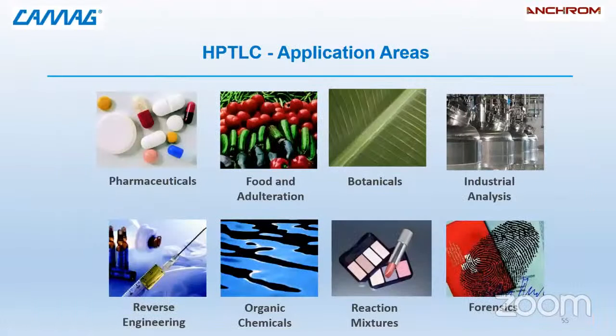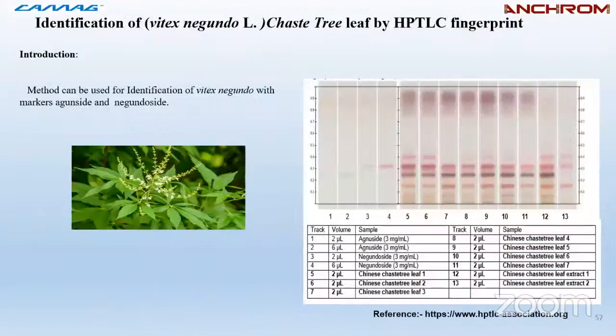Now we will see applications, especially in the herbal field. As HPTLC is a diverse technique, it has applications in many different fields like pharma, food, botanicals, industrial analysis, forensics, cosmetics, but our focus will be on botanical applications.